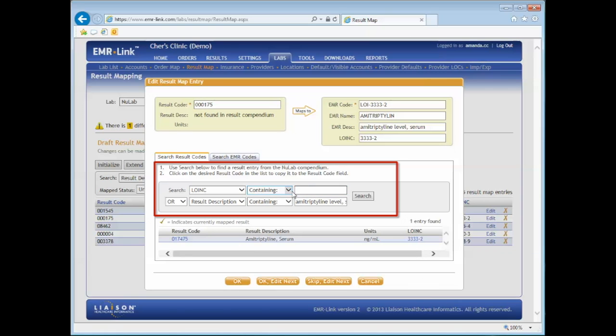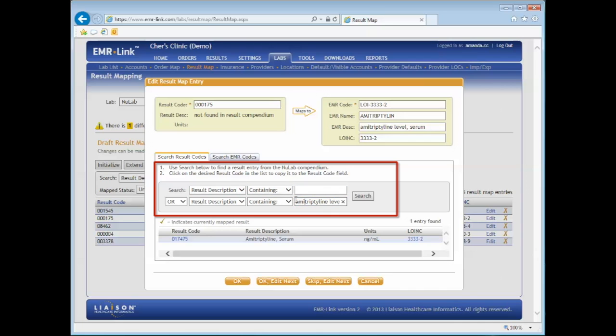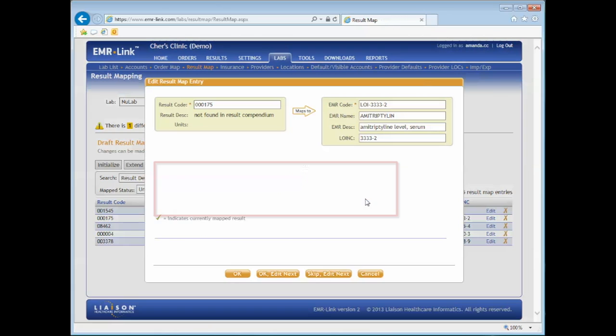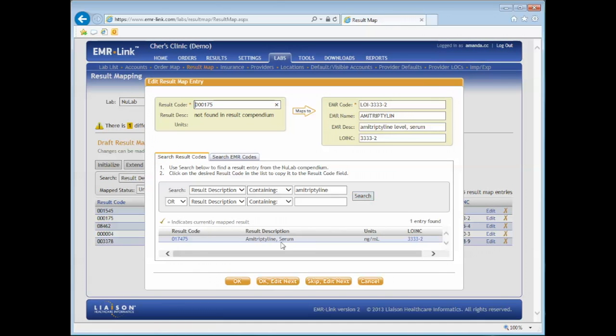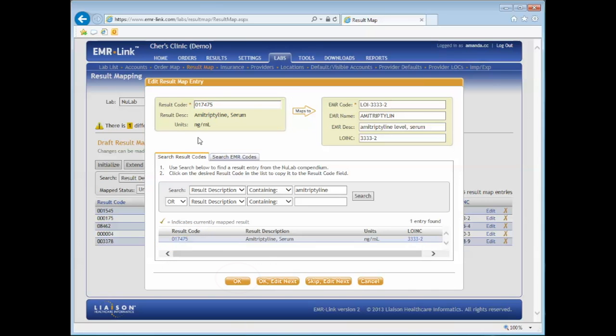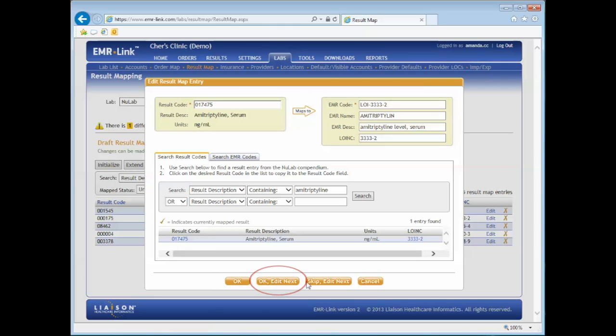Modify the filters in the gray search box to search for your updated result codes. Once you've found the correct result code, click on the blue result code. This will automatically replace the outdated result code with the new one. Then click OK if you've finished or OK Edit Next to map the next line in the result map.